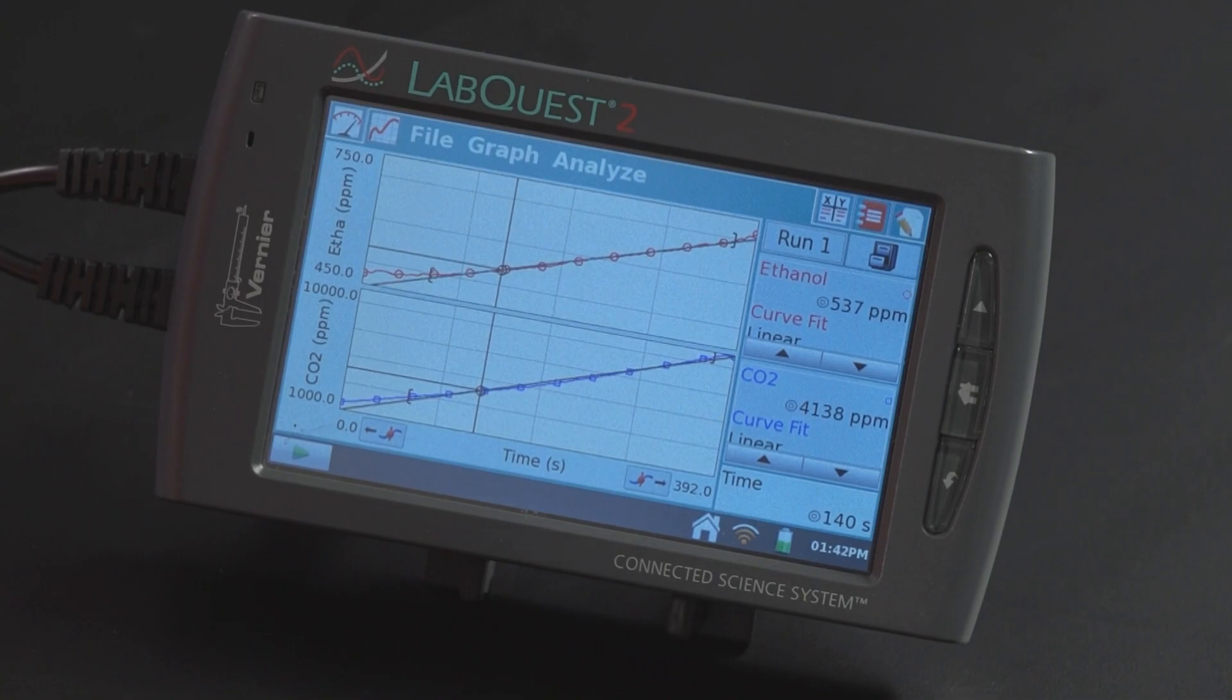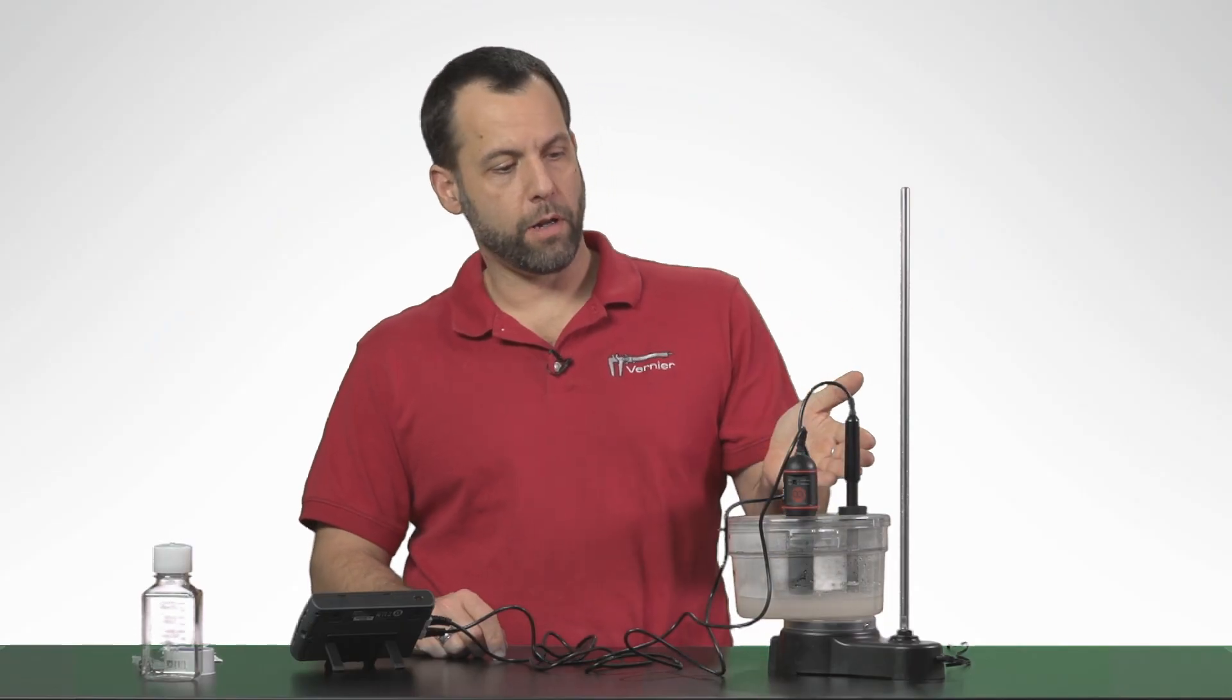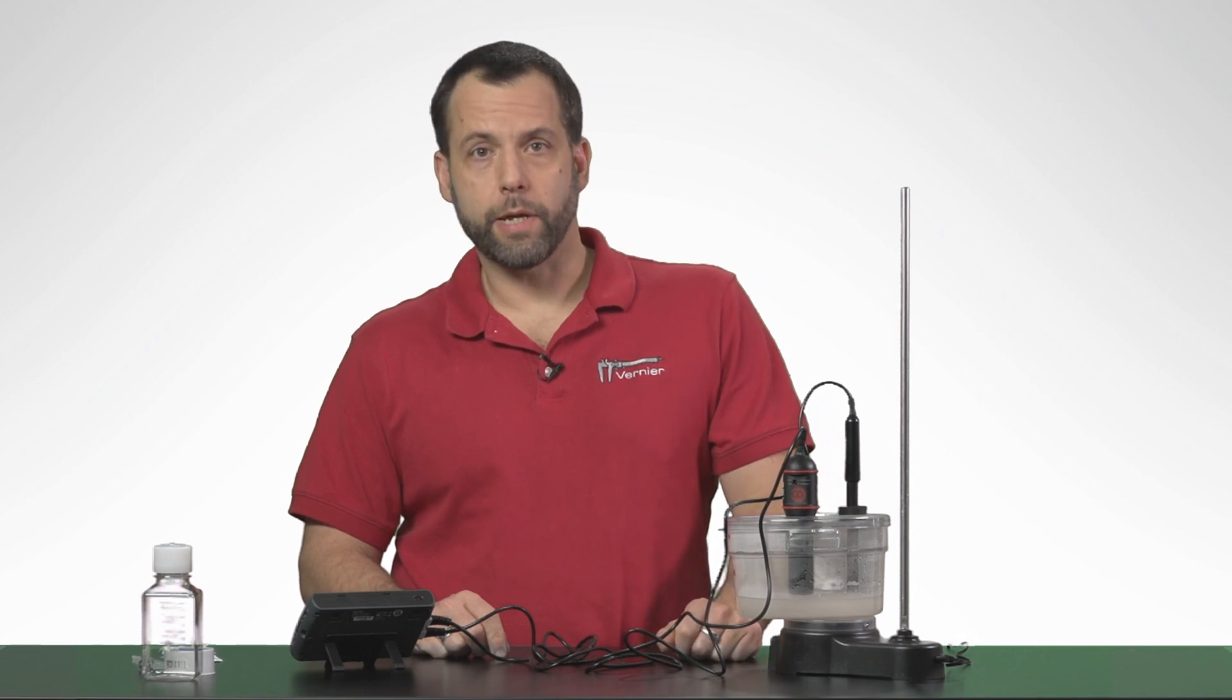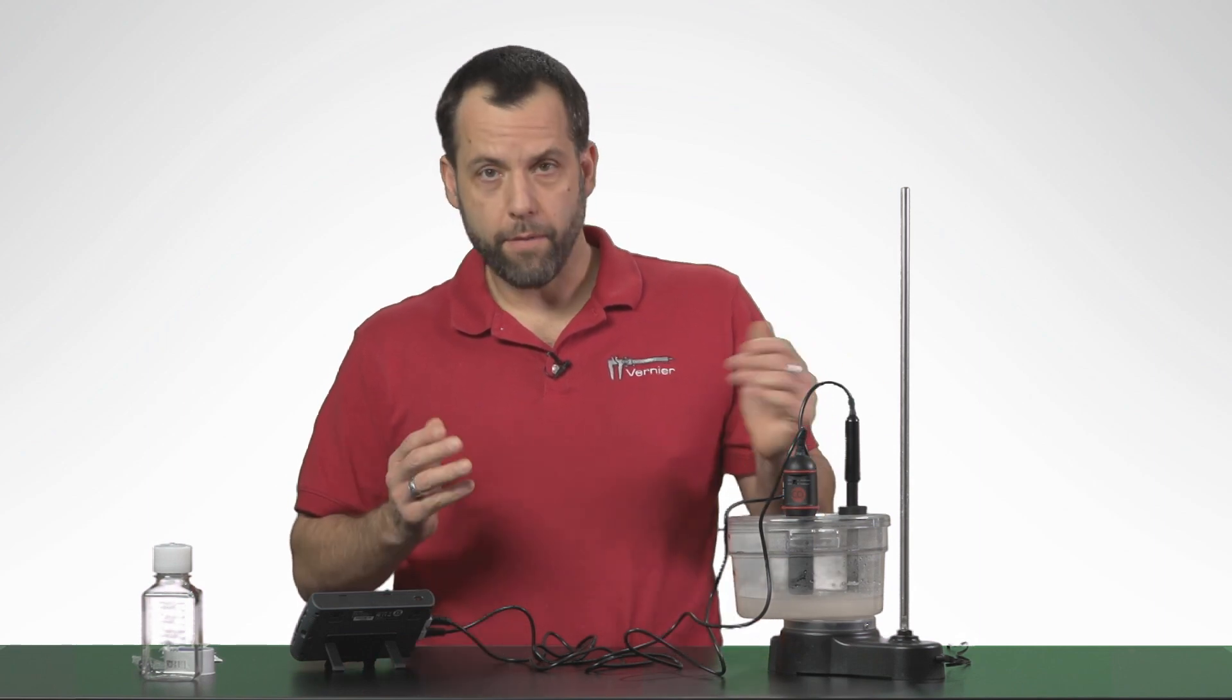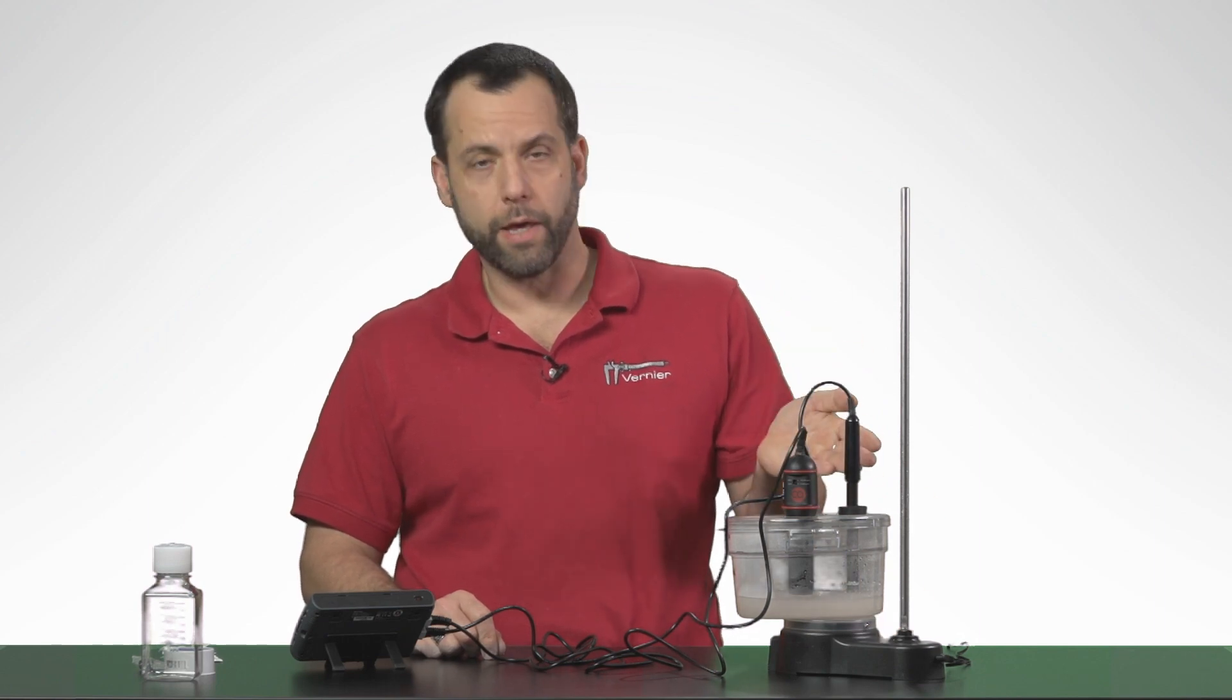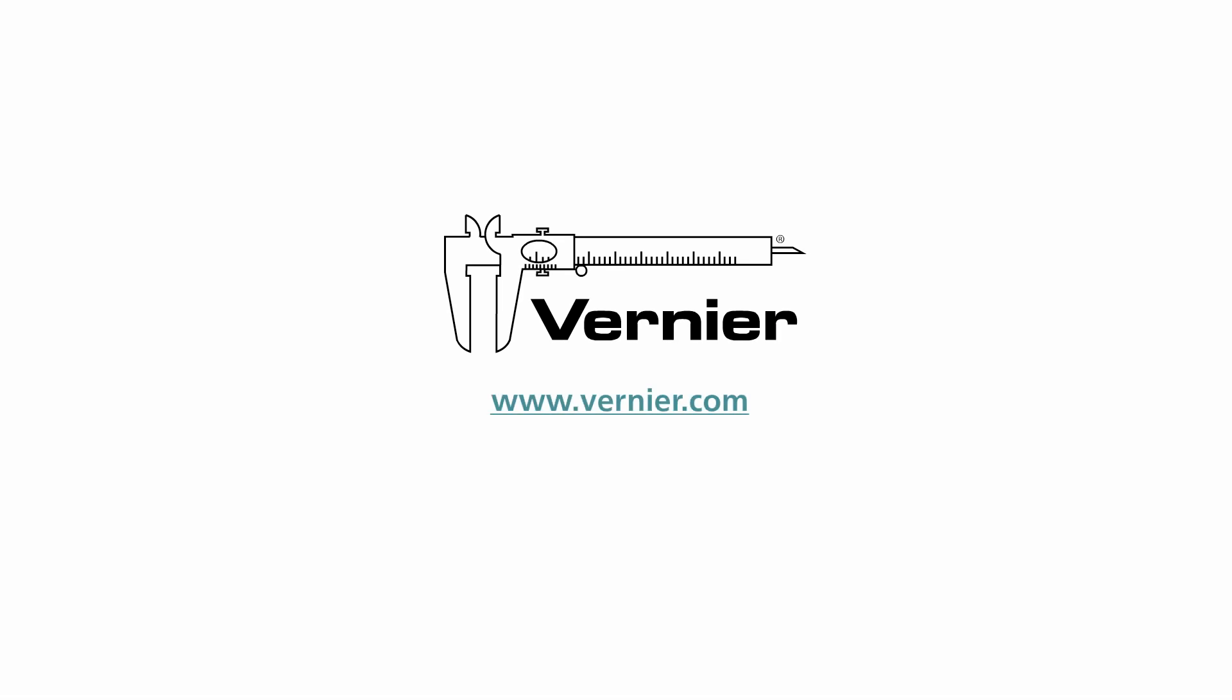And that is a very simple demonstration of how you can use our ethanol sensor and our carbon dioxide gas sensor to look at fermentation with yeast. If you have any other questions about cellular respiration or fermentation or CO2 sensors or the ethanol sensor, just go to our website at www.vernier.com.